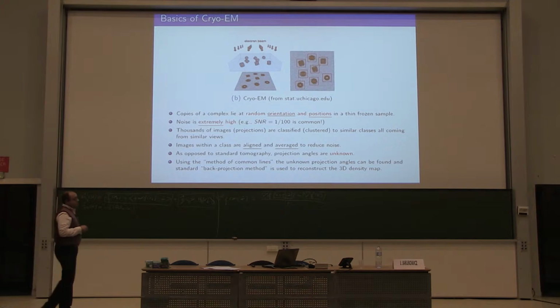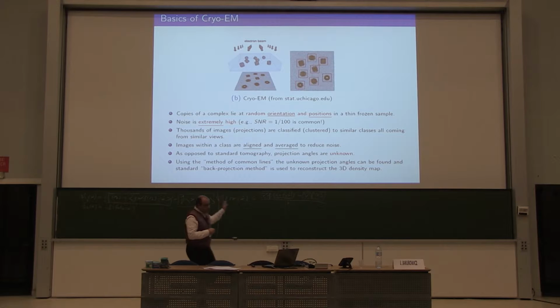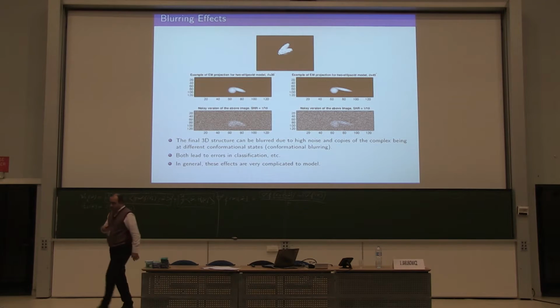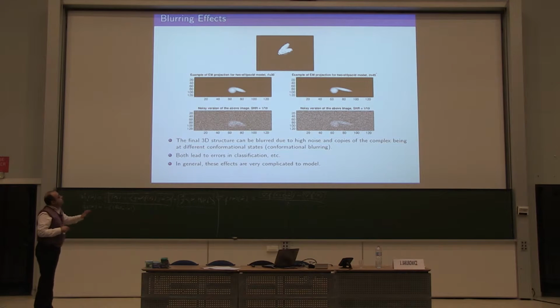3D molecule. So this has been done and still is a complicated process. It's not perfect, but in our setting we assume that we have such an algorithm giving us the 3D reconstruction. But what happens in practice is that, for at least two reasons, what you get will be very blurry.